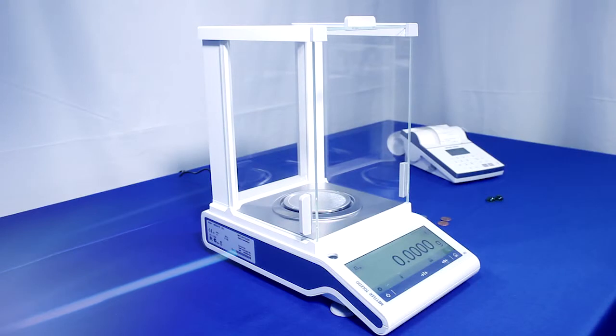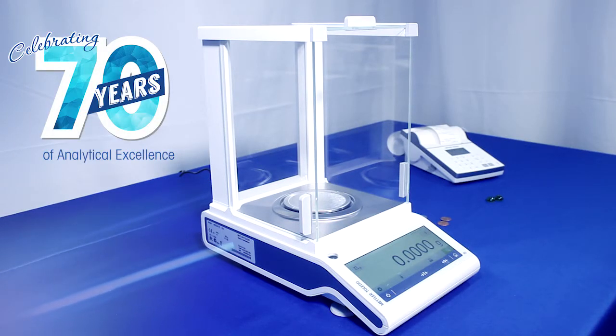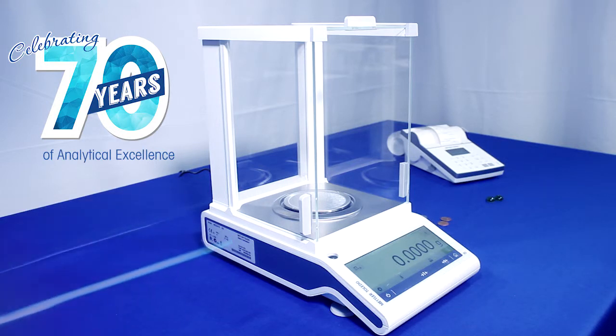With the new classic MSTS balance, we built off our 70 years of weighing experience to design the ideal balance for the everyday user. For more information, visit us on the web or contact your sales representative.